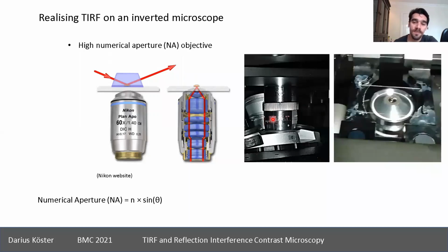They're there because these very high NA objectives are very sensitive to the environmental properties. So if the temperature changes, for example, from room temperature up to 37 degrees, this is already enough to change a little bit the optical pathways inside these objectives. So there's this correction collar to then adjust for the temperature to image it. They also allow you to adjust for the glass thickness to image with.